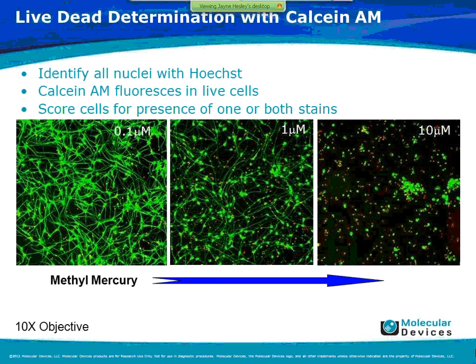Another way we did the live dead determination was using the live cell stain calcein AM.